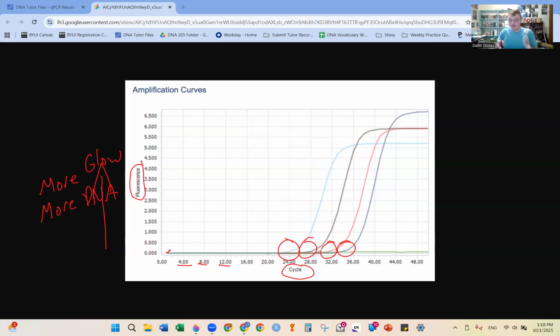But if I'm trying to find a person in a million people, I'm going to find a person really quick, right? So the more starting copies of DNA you have, the easier it is for primers to find a starting copy of DNA. If we start out with only 1 or 2 copies, the primers might not find those starting copies for a few rounds. It may take them a while because during the annealing step, they simply don't have enough time to hunt it down.